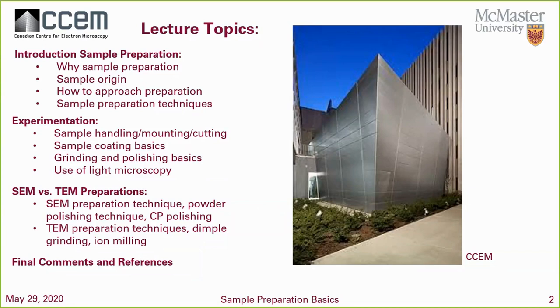And one topic that I don't see used a lot in sample preparation, although I know that microscopists use it a lot, is that not a lot of people tend to understand that the use of light microscopy is really important. So I'll be talking about some of the tools that are available. And then to finish it off, I'll be showing you the combination of all these things that you're learning in terms of experimentation and the background of the sample to prepare some samples for SEM and TEM.